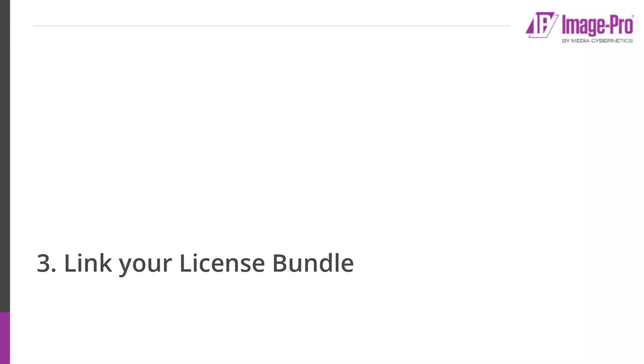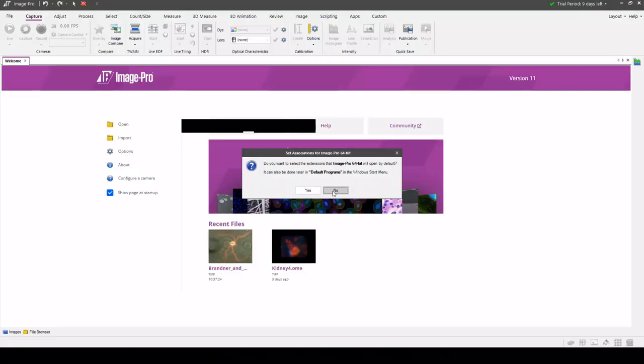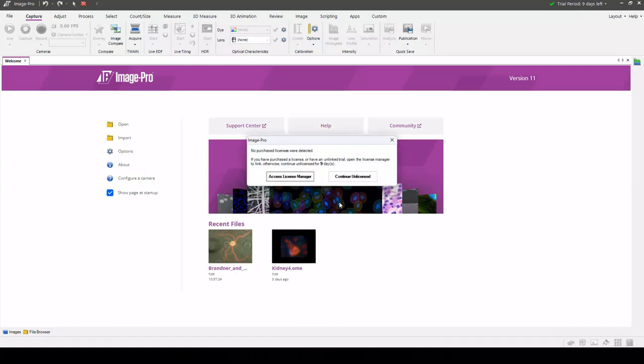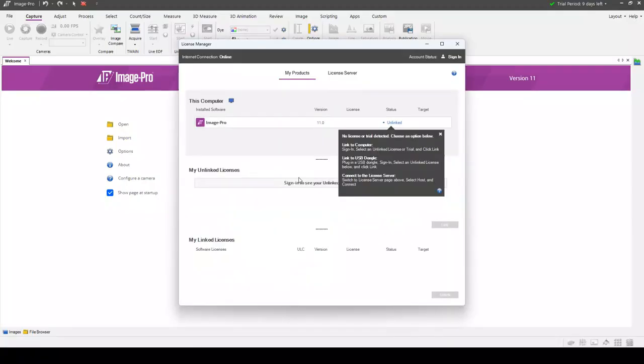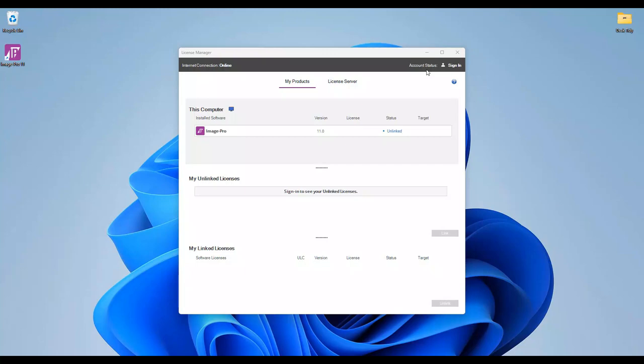The third and final step is to link your license bundle using the License Manager. If you open ImagePro during the trial period, you'll have the option to access the License Manager when ImagePro opens. If your trial period is expired, the License Manager will open directly. You can also access the License Manager from the ImagePro help menu or by typing License Manager in the Windows Start menu search field.